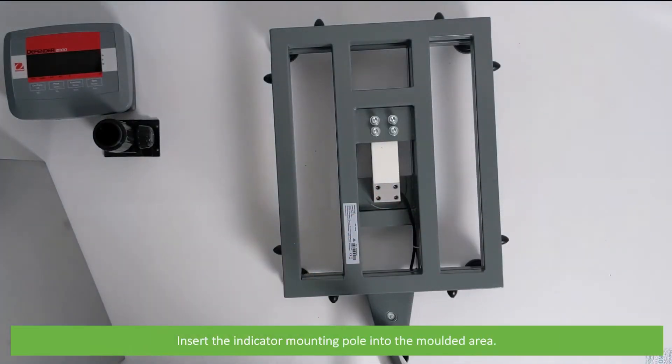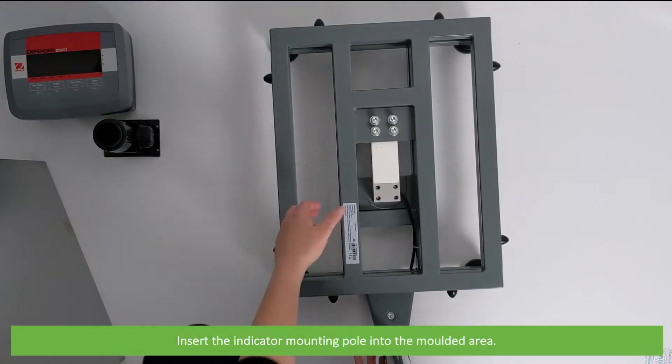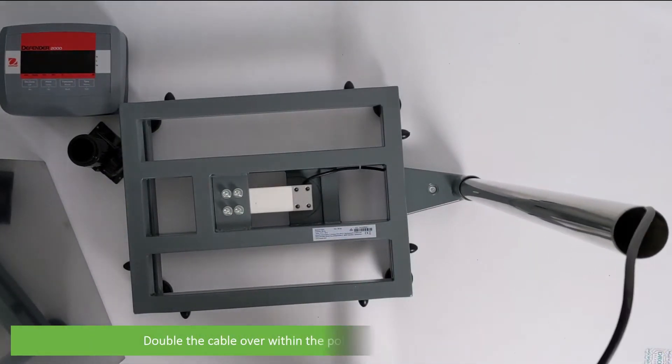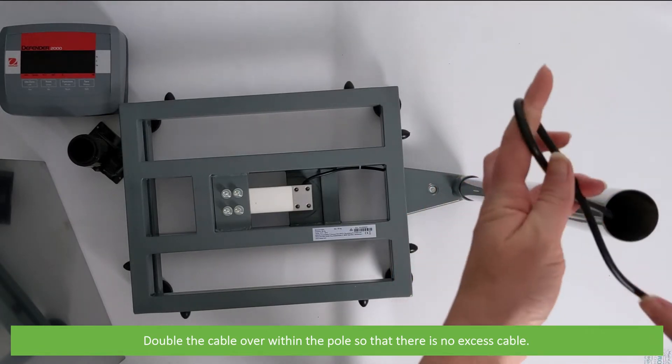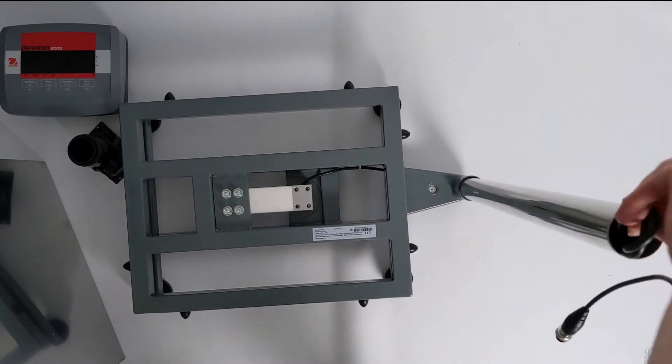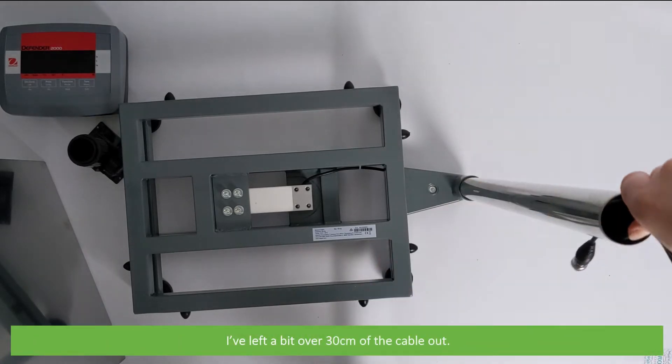Insert the indicator mounting pole into the moulded area. Double the cable over within the pole so that there is not excess cable. I've left around 30 centimeters of the cable out.